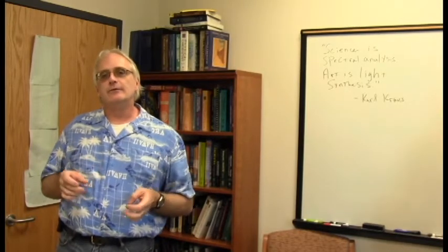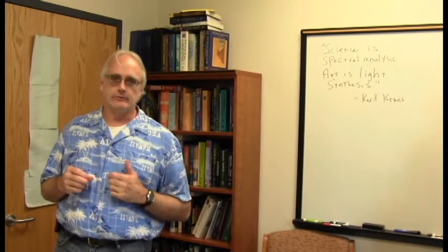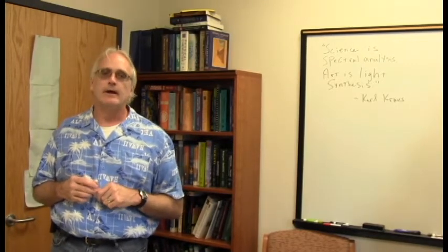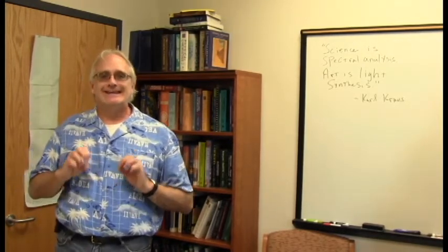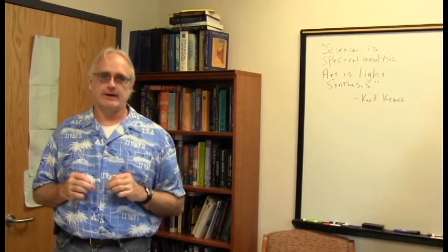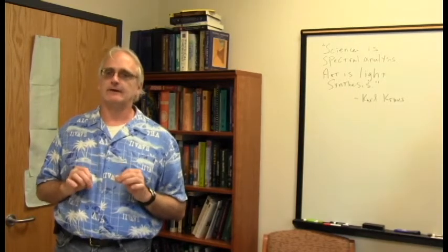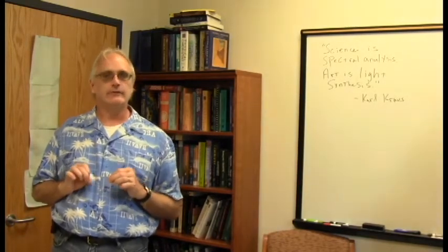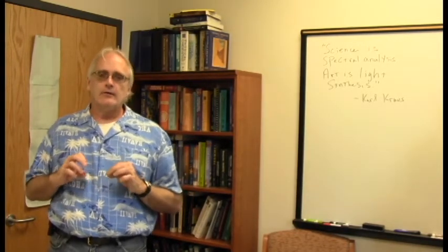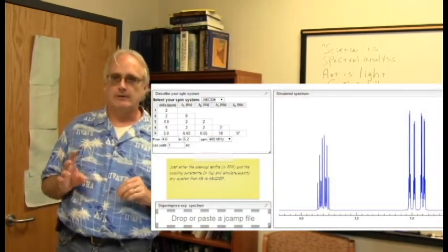And finally, the ultimate in trying to understand and measure coupling constants is to extract them out of the spectra like we've done with the assistance of a homonuclear decoupled spectrum, and then to actually go and simulate that spectra and see how well it matches the actual measured spectrum. There is software that will do this, and you can also find websites that are very clever and will do this. And I have a link to one that I'm using for this demonstration on the course website. Here is the simulation and the parameters I used in the actual spectrum.